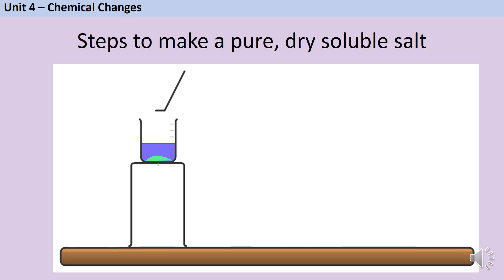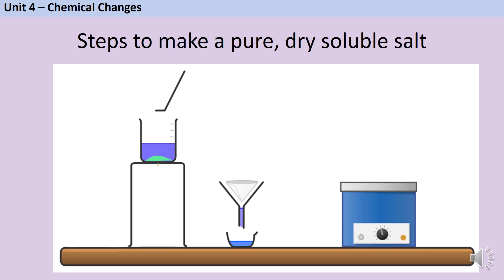In this reaction you do see a color change and we make this blue copper sulfate solution. Now I want to remove the excess base — that copper carbonate — from the solution. I do this by filtering it using a funnel and filter paper. Now I have my pure copper sulfate solution and I want to turn it into crystals, so I need to remove the water — usually by putting it in a hot water bath.